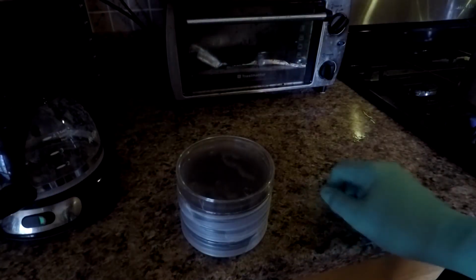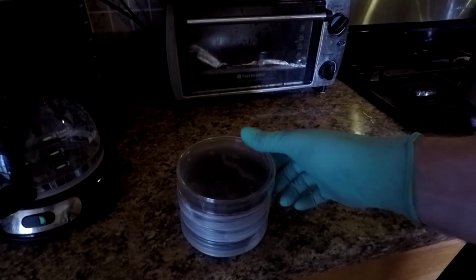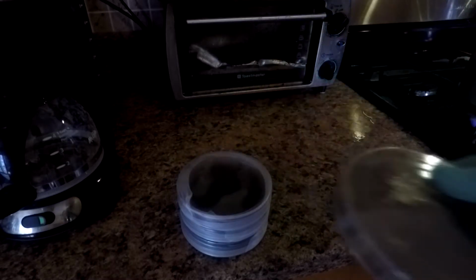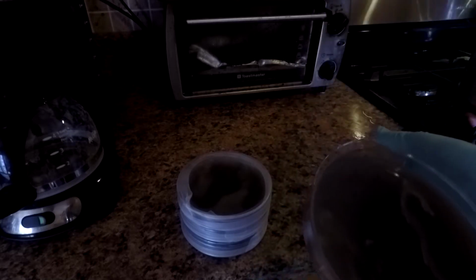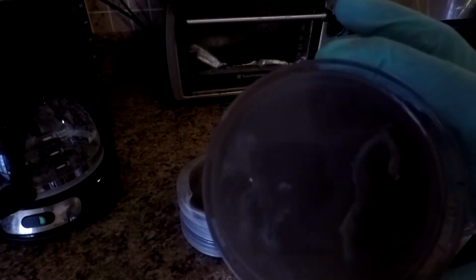Well, unfortunately, this first batch of petri dishes didn't go so well. I'll show you what happened. Where the drop of the spore syringe streaked across, you see I opened it in my kitchen instead of in the lab room. I got bacterial contamination. You can see the one side drop streak and the other side drop streak.